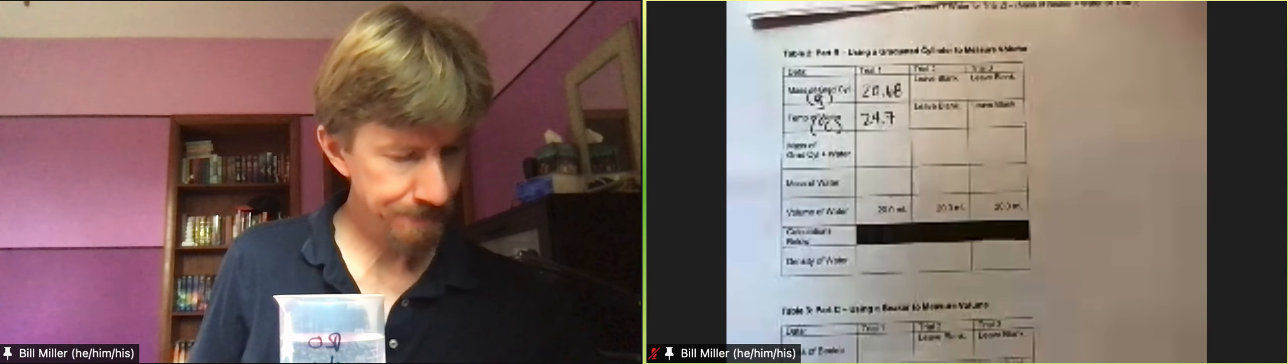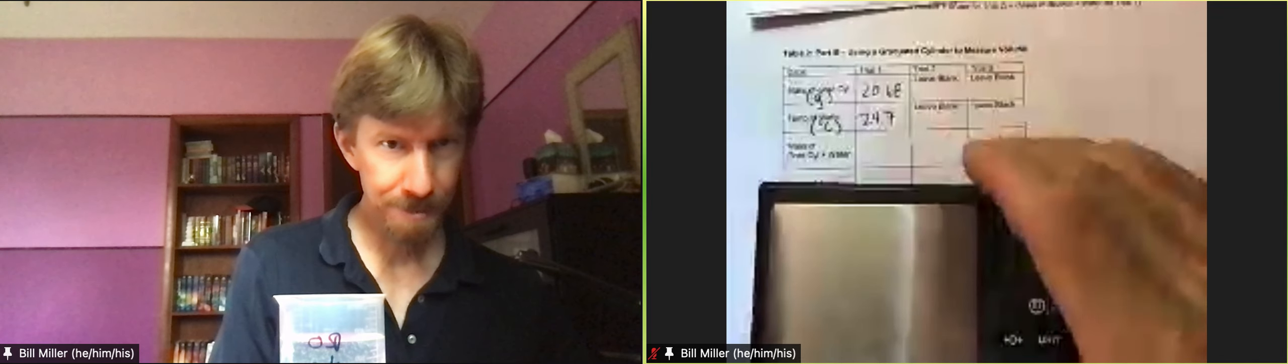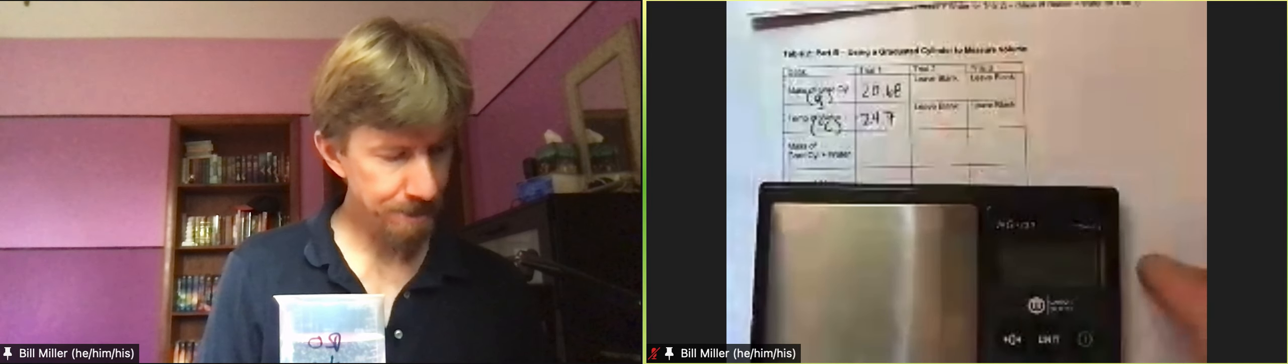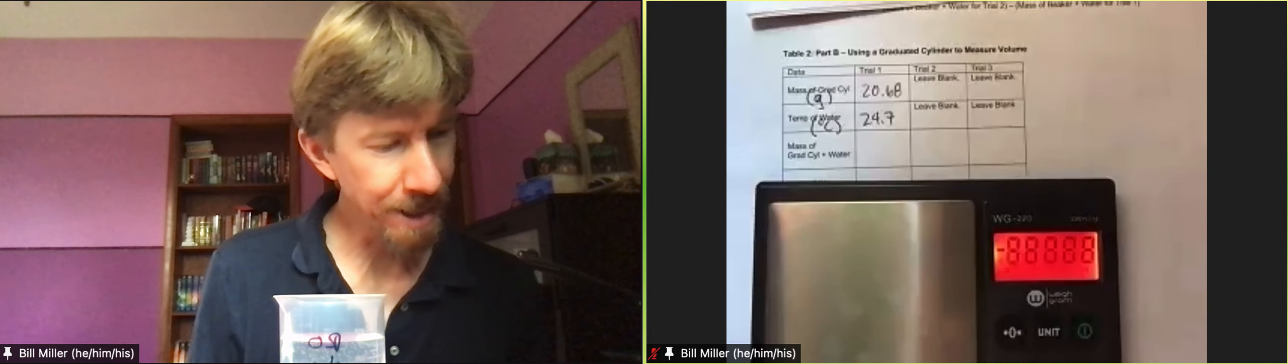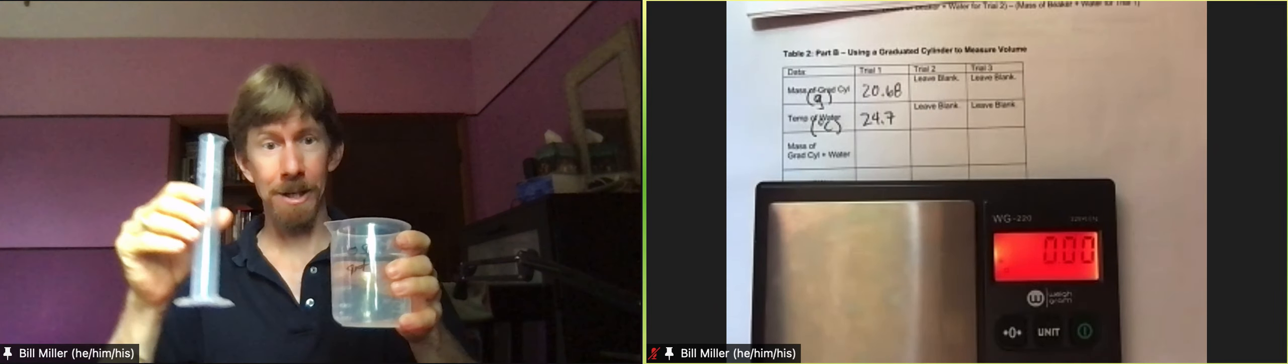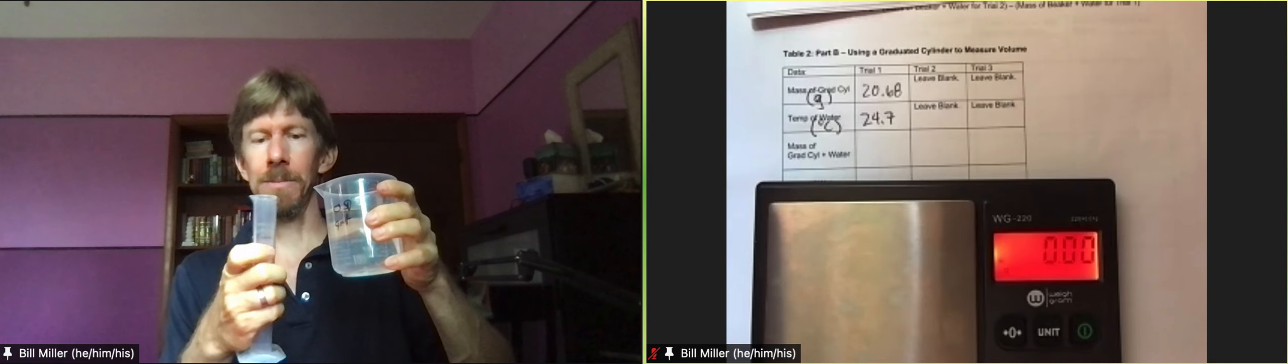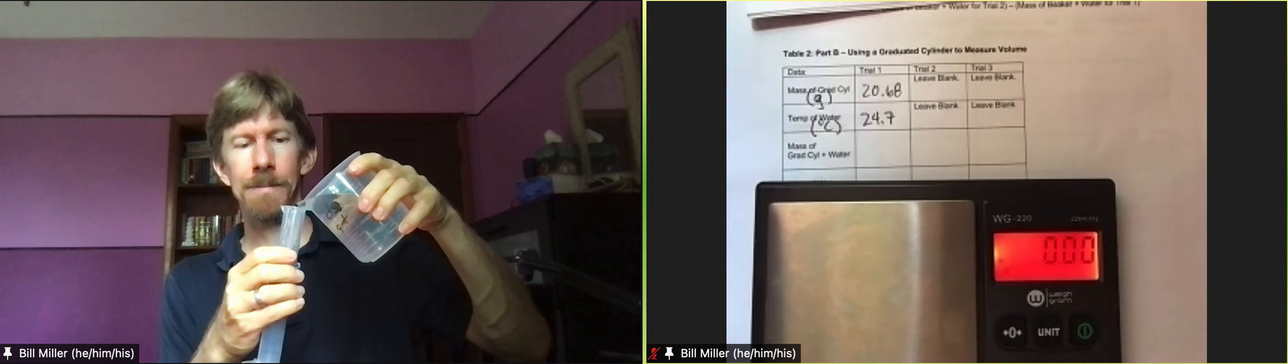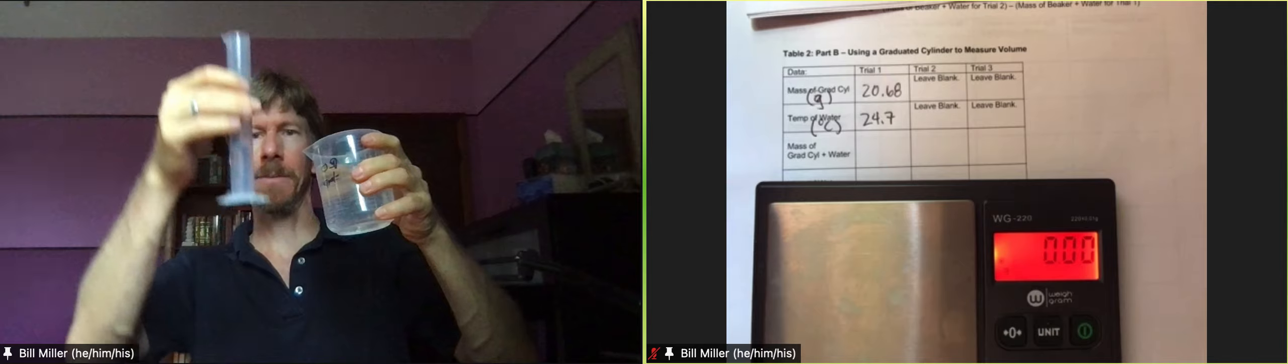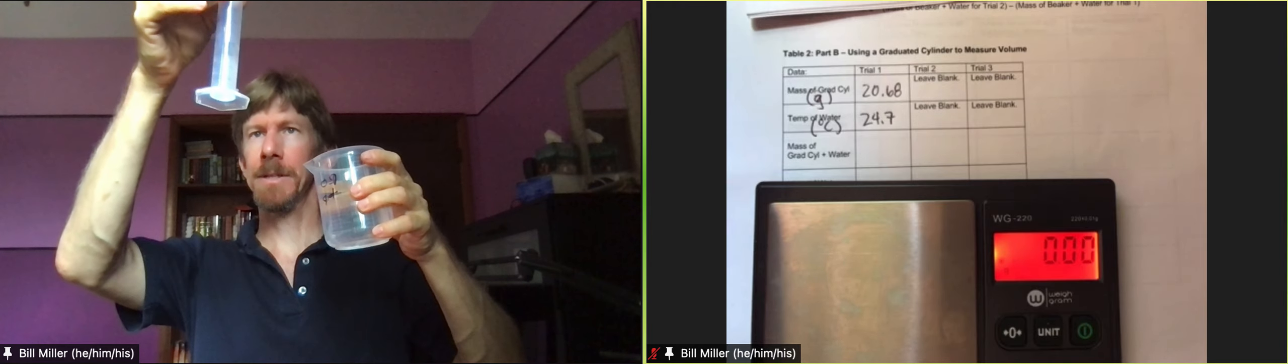Now I'm going to do mass of graduated cylinder plus water. It says measure out 20 milliliters of the room temperature distilled water. I'm going to measure this carefully away from my computer, and I'm going to get it close to 20, actually very close.